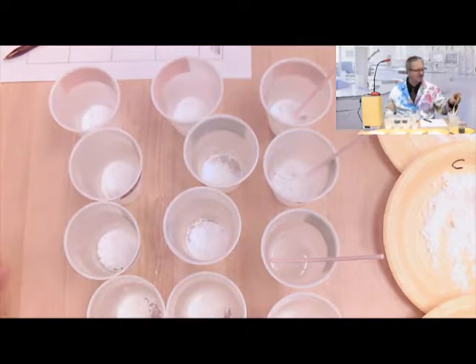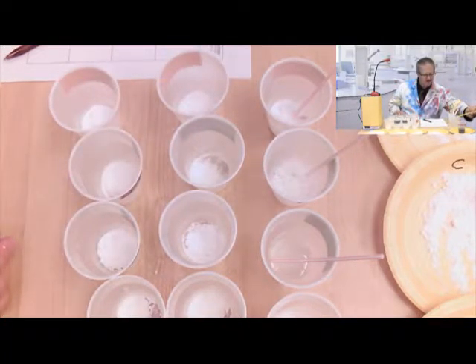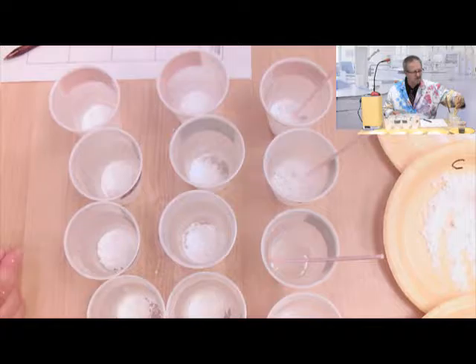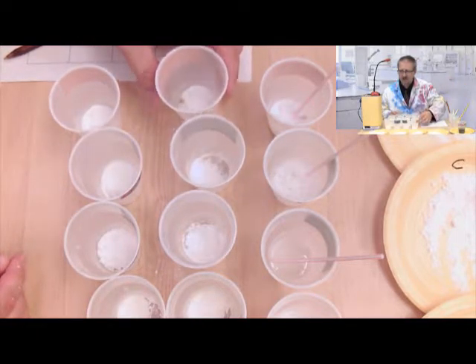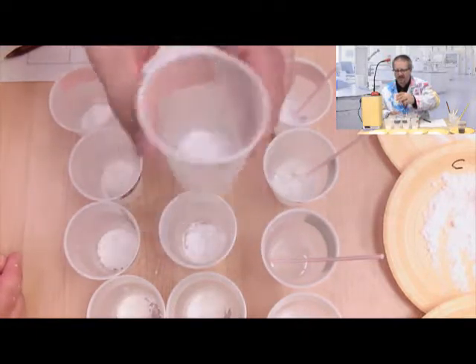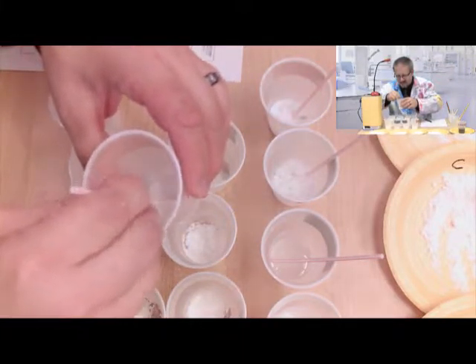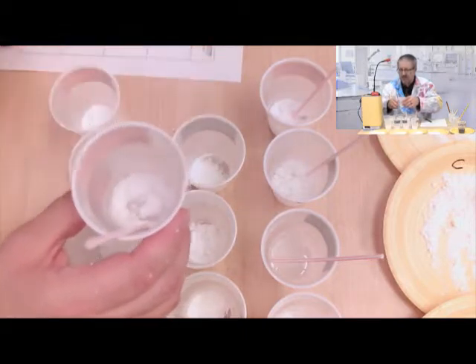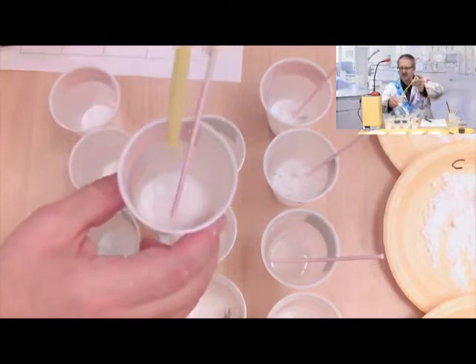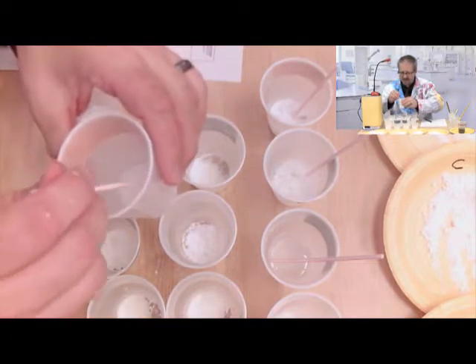So I'm going to use the yellow straw for vinegar. And now one of these goes. Okay, so that one's producing a gas. It's bubbling, it's fizzing. Let's see if we can get a little stir rod here. Let's put a little bit more vinegar in so we can see that reaction. Okay, it bubbled up really quickly and then died down pretty quick.